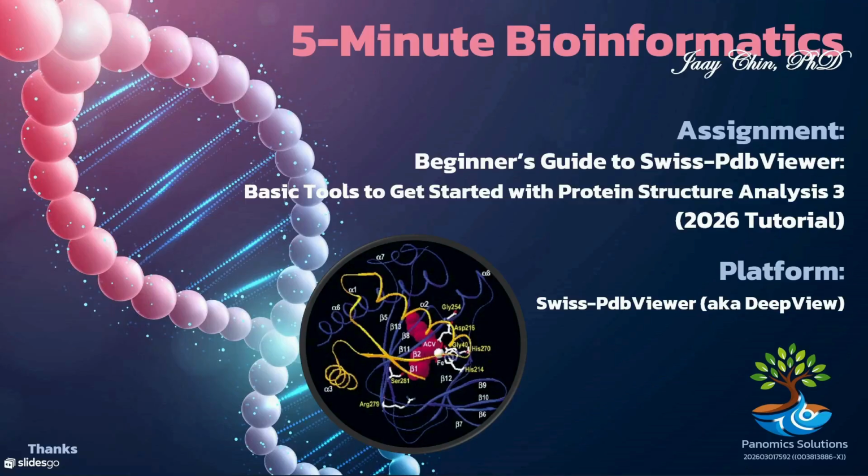In this session, we will focus on mastering the essential tools you need to effectively visualize and customize protein structures according to your research or presentation needs. After completing this session, you should be able to use all the basic features in Swiss-PdbViewer to display protein structures exactly the way you need, whether for analysis, teaching, or publication.